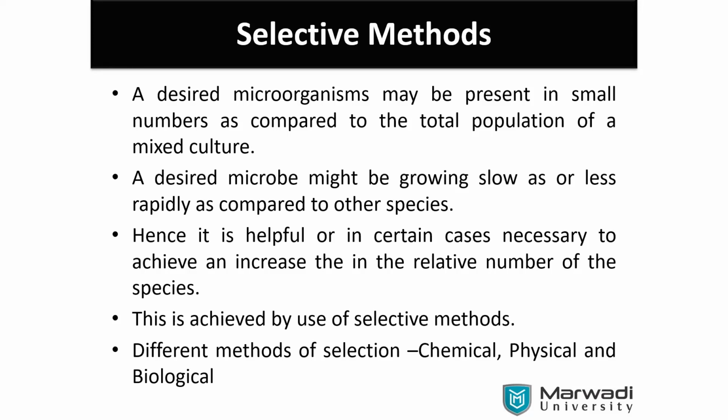So same on a Thursday, we'll go for the discard. How to discard it? We'll go for the media preparation afterwards. So on a Thursday, we'll discard it. That is a basic protocol even: how to handle, how to discard. Currently, we are knowing that it may be a fungi. Today is a Tuesday. On a Thursday, when we are going to open it, the bacterial growth or the fungi may have overgrown. Maybe the complete area has started to get covered.